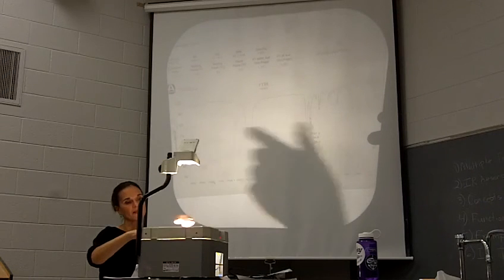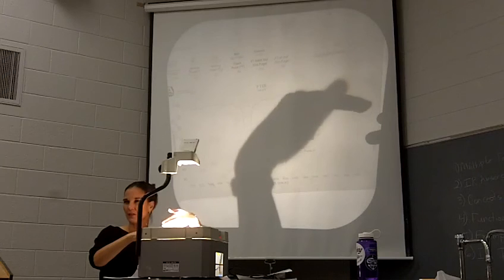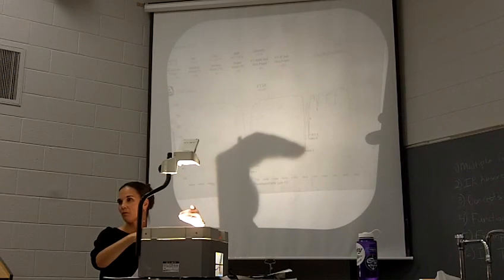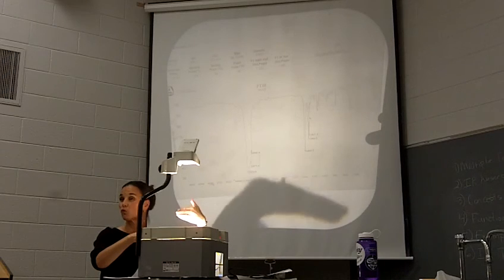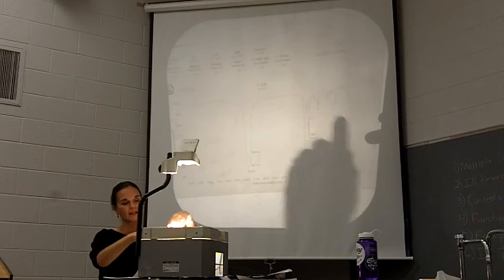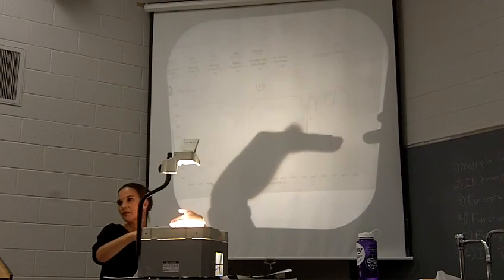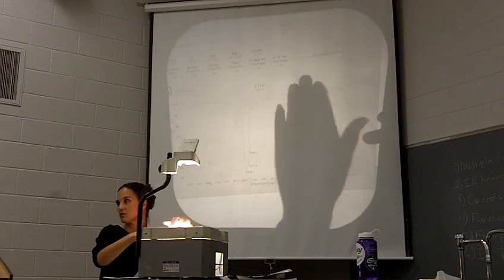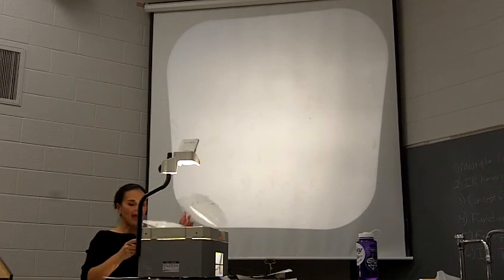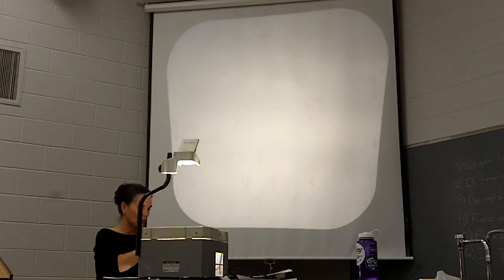Now, pull one of these up. Say you see this spectrum, but all the peaks are shifted up a little bit. That has to do with how much sample you have, not the intensity of the peak. So it's the relative intensity of the peaks that you're looking at. If you had all these same peaks, all the same relative intensity, and everything was just shifted up a little bit, you have a little less sample than the sample that was used to collect that spectrum, okay? So that is what you're looking for when you're trying to decide if you have a match or not.